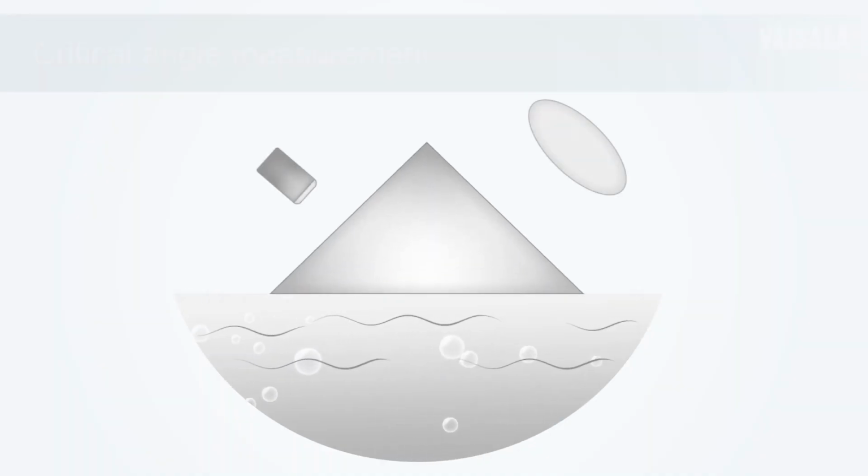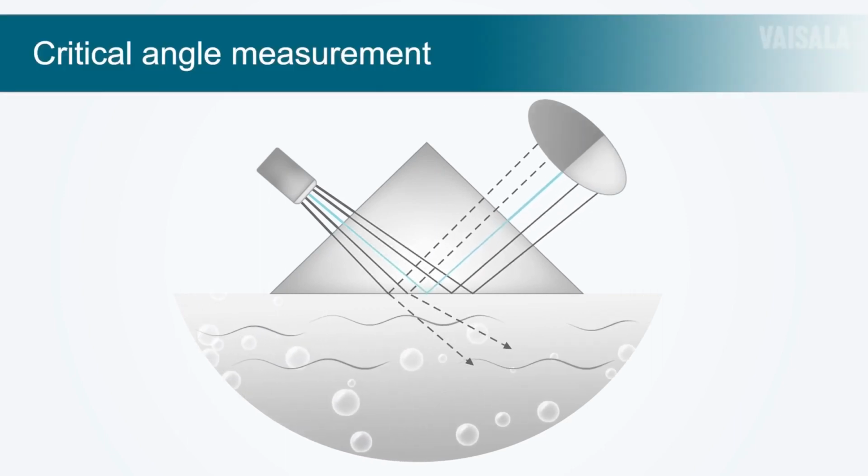Well, the refractometer is making a measurement of an actual physical property. It's a direct measurement. So there are other measurements which can infer the concentration, but with a refractometer, you're actually directly measuring the refractive index. So that's a huge benefit over other measurement devices.